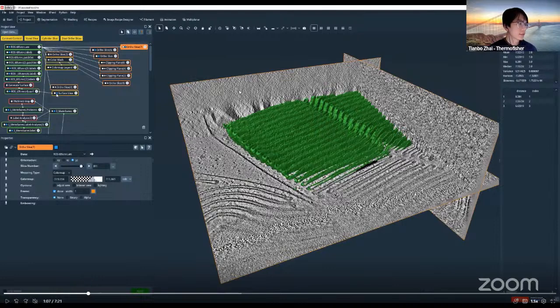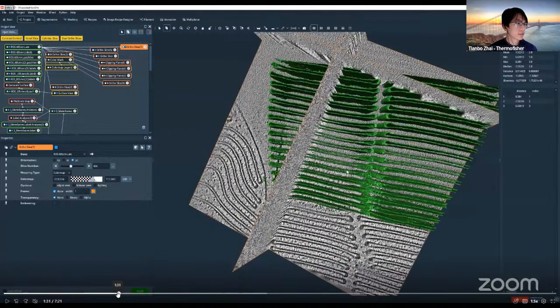In this case, because this could be a rather large data set, we're taking a 3 slice view so that we save computation time, but at the same time understand the scope of our data set. As you can see, this is another view from that 3 cut plane on the X, Y, and Z.